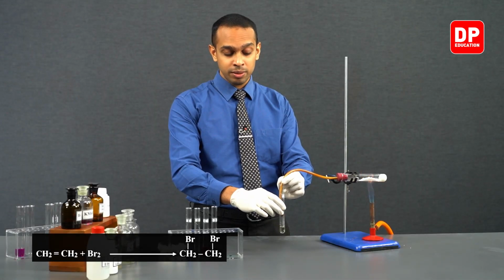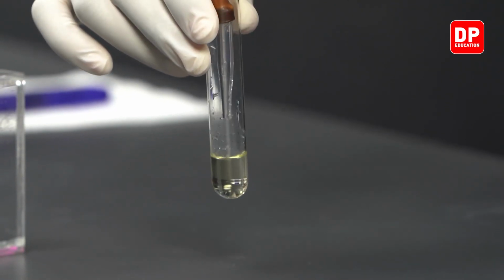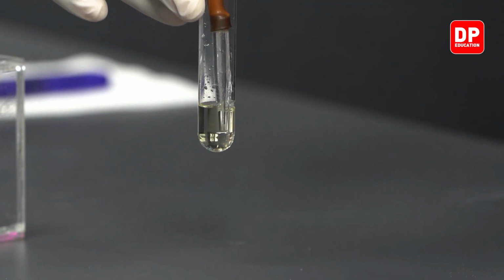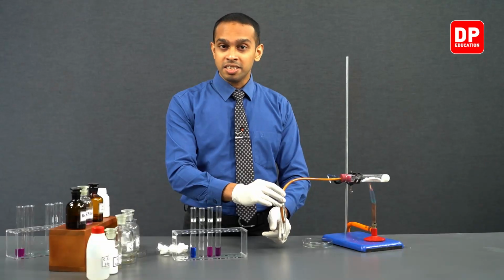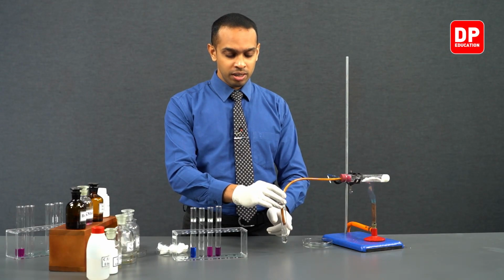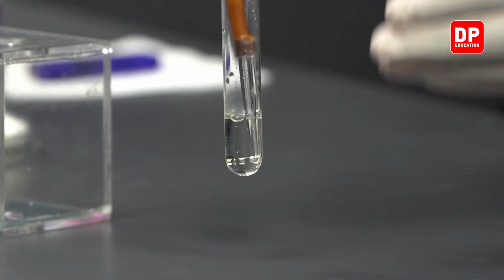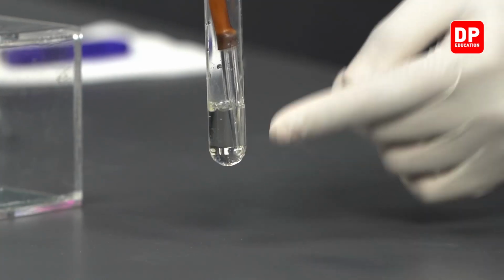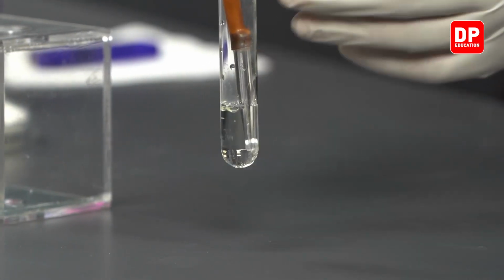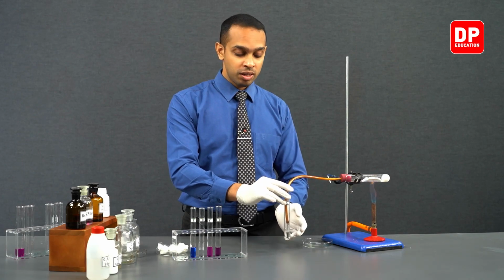This yellow color in bromine water is there due to the presence of bromine, and as we can see, there is still a small yellow color that we can observe here, but as the reaction proceeds, as more and more gas reacts with this bromine water, the color will completely disappear and we will observe the formation of a clear solution.